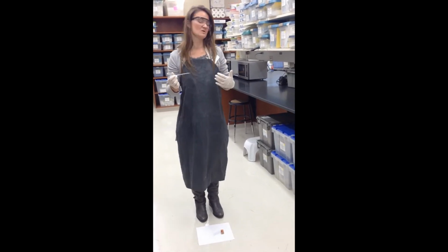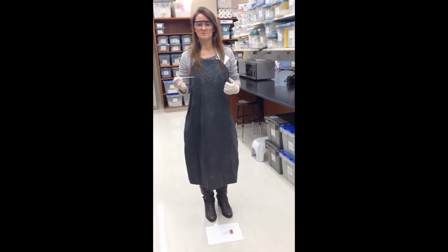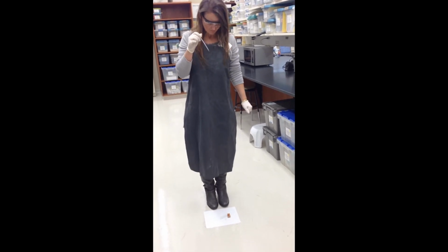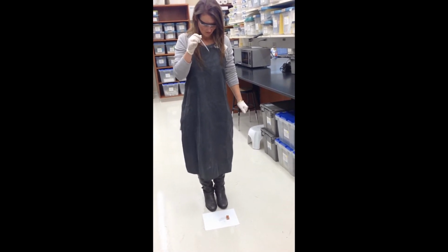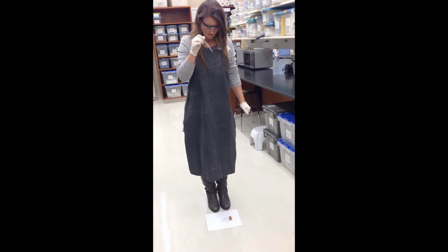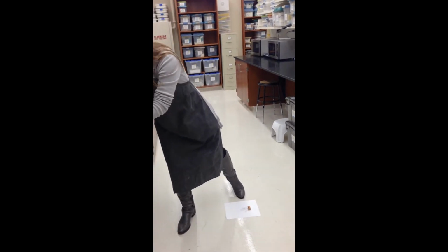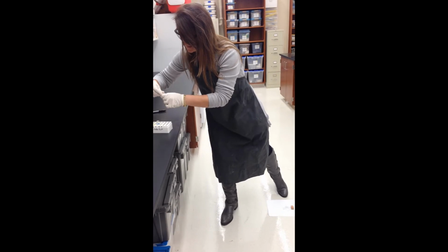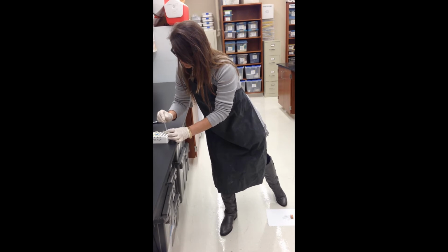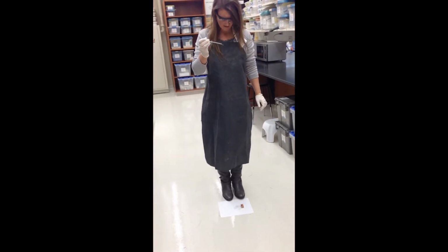However, after doing this lab a lot of times, I've learned that in order to burst those cells open, they actually have to be dropped from a little bit of a greater distance. So we're going to start here, and you will drop one drop at a time. There's one. I'm actually going to have to get a little more. I wasted all my drops. Okay. Alright, let's try this again.